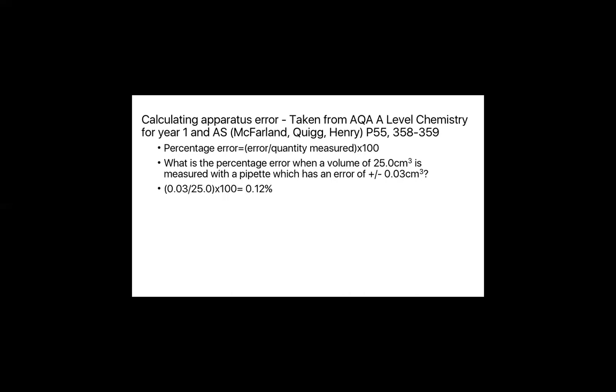Okay. So yes, indeed, answer came through. It will be 0.12%. It's 0.03 divided by 25 multiplied by 100, 0.12%. Okay, let's have a look at a burette then, because these are a little bit more involved.